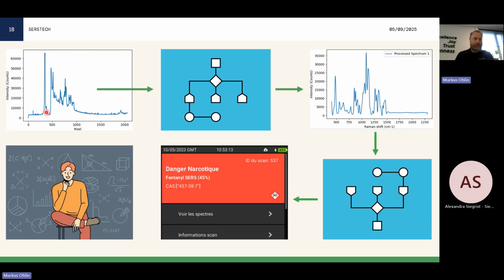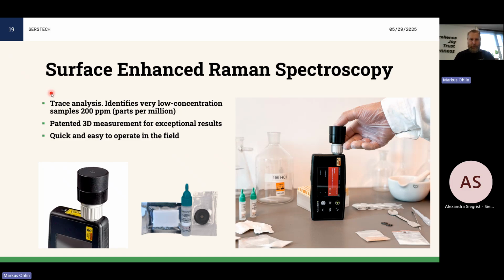Although since there's so much Rayleigh scattering, there will always be some Rayleigh scattering from the laser coming through. So that's why you still see the laser light here, and the fluorescence is cut at a certain wavelength. That's why it ends abruptly here. I hope that was an answer to the question.